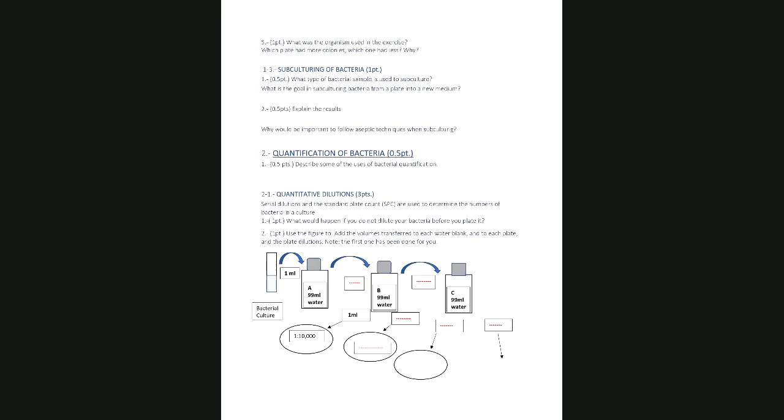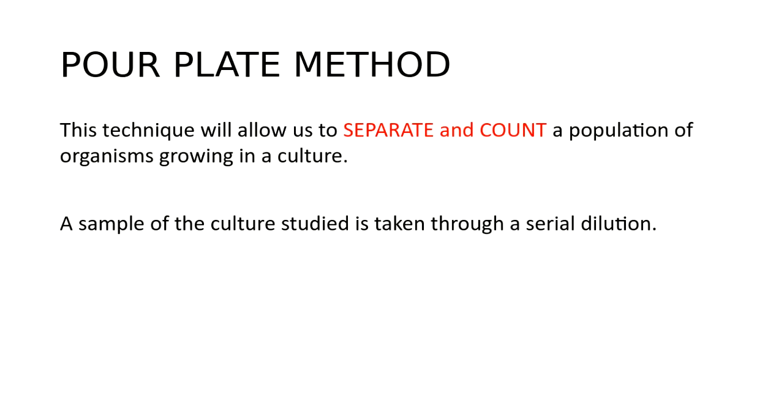All right, so quantification of bacteria is going to allow us to separate a culture enough that we will be able to actually count cells. So the idea of this technique is to be able to count the number of organisms per mL of a culture.